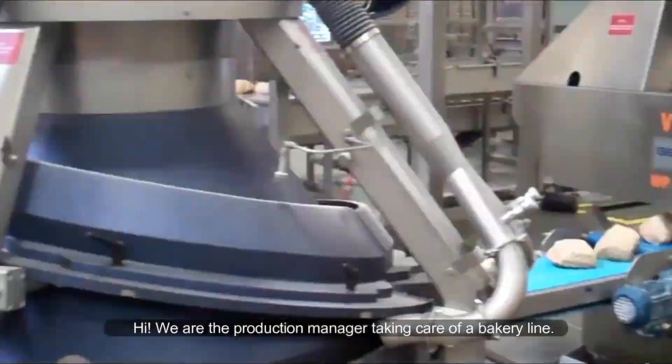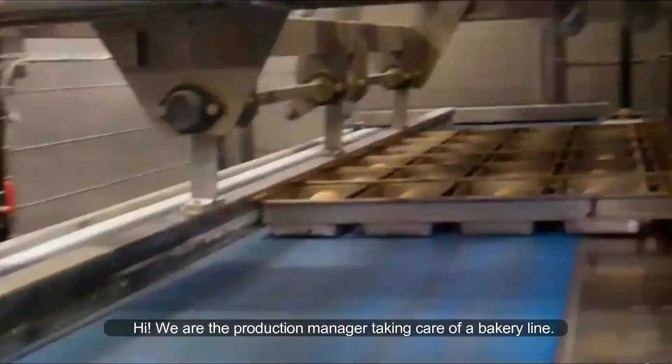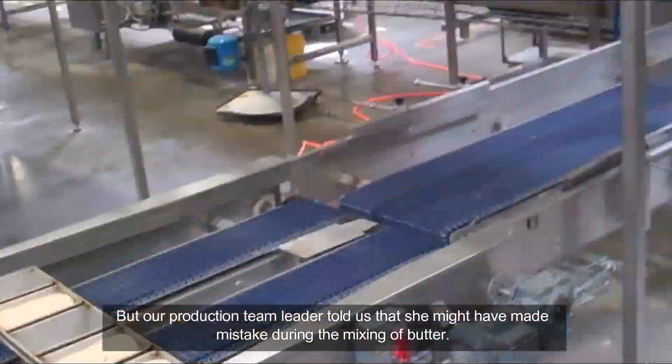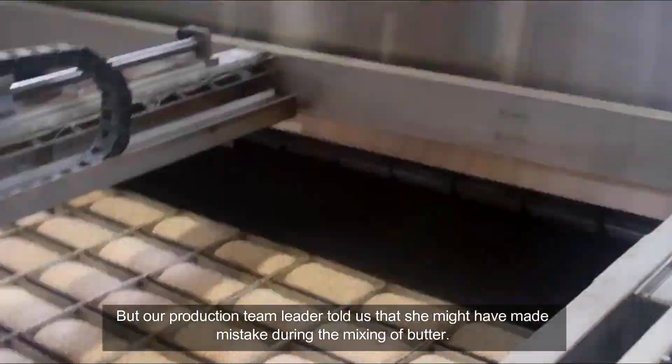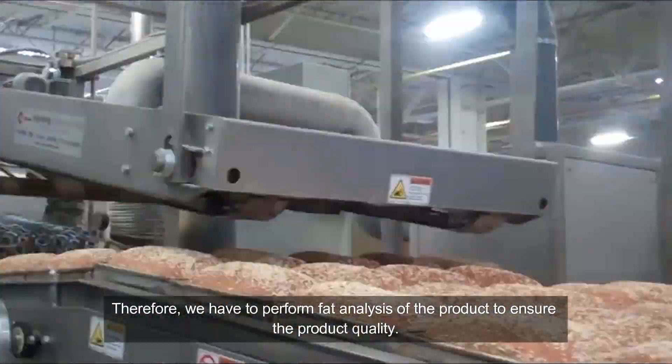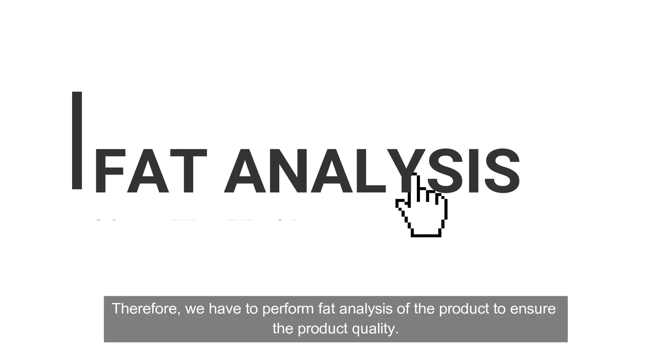Hi, we are the production manager taking care of a bakery line. Our production team leader told us that she might have made mistakes during the mixing of butter. Therefore, we have to perform fat analysis of the product to ensure the product quality.